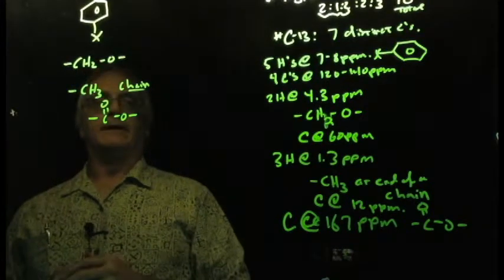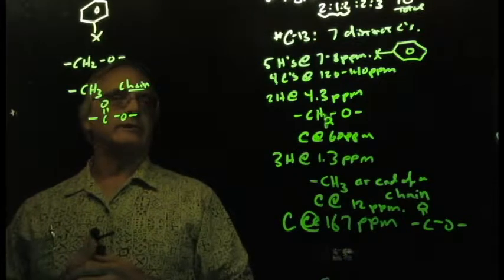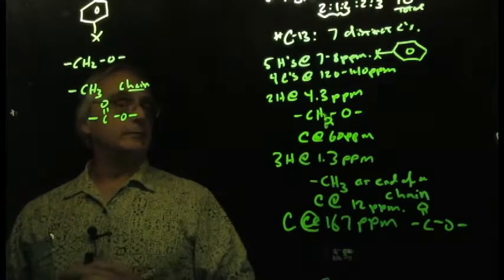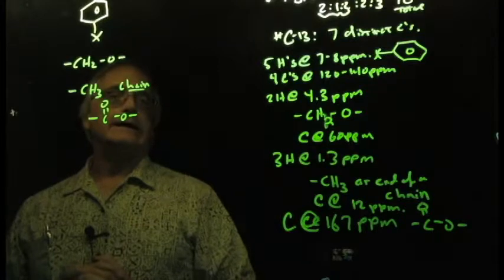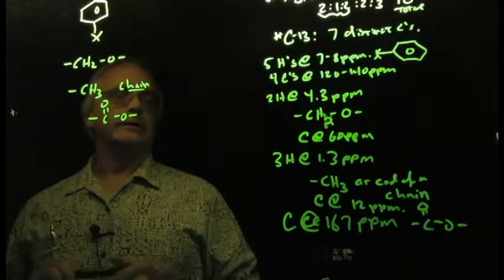There, I think we'll stop there. And there are your puzzle pieces. The task now, of course, is to put these together into a viable molecule that doesn't violate any organic chemistry rules. So, that's how you approach doing this sort of thing.